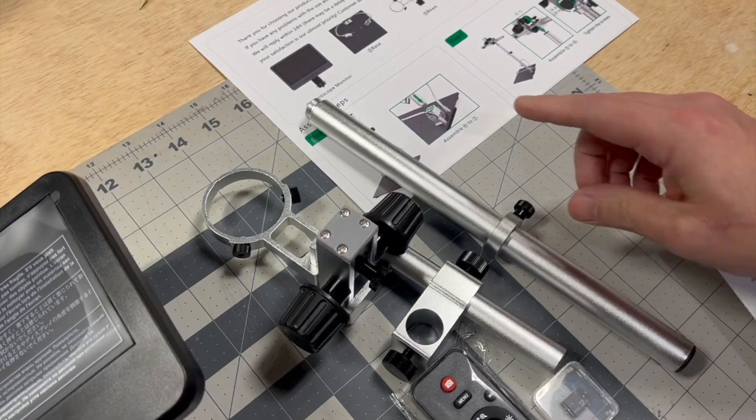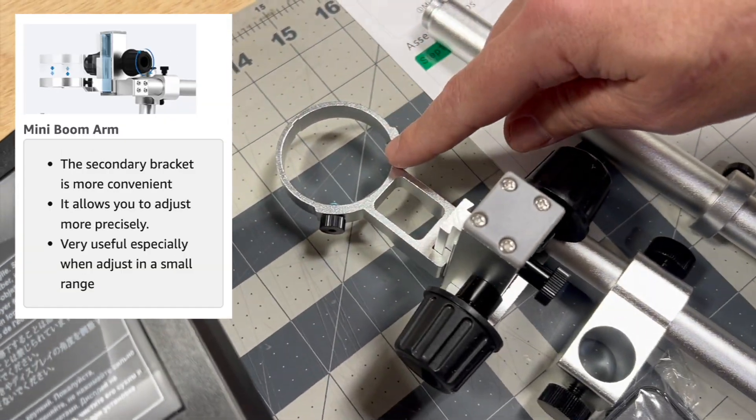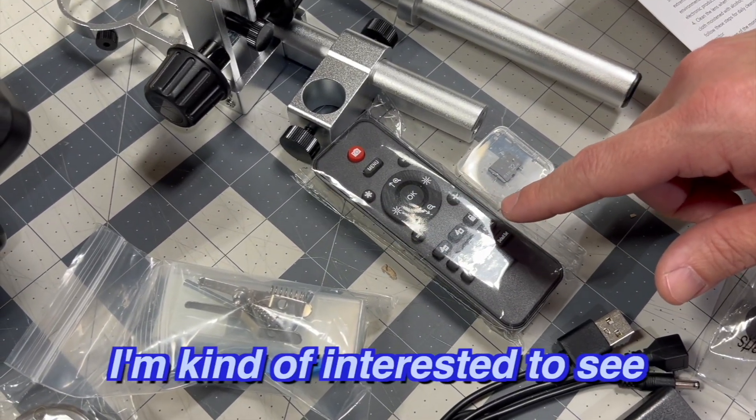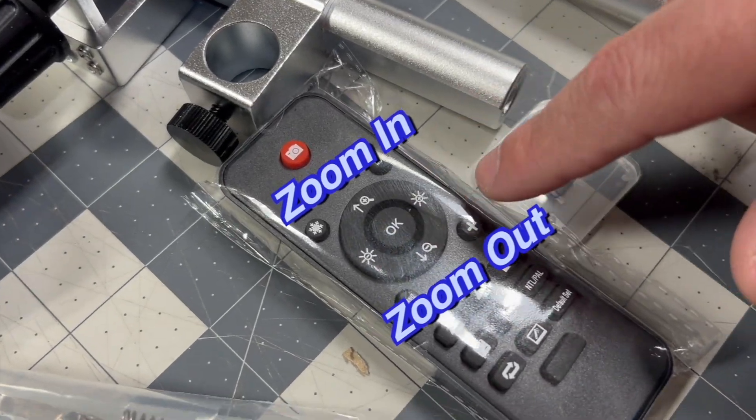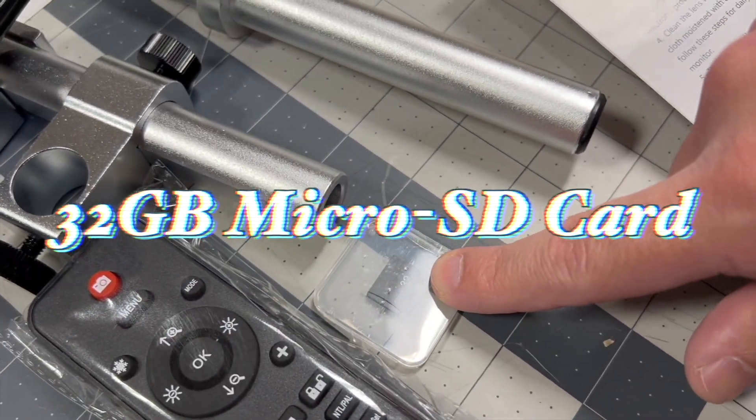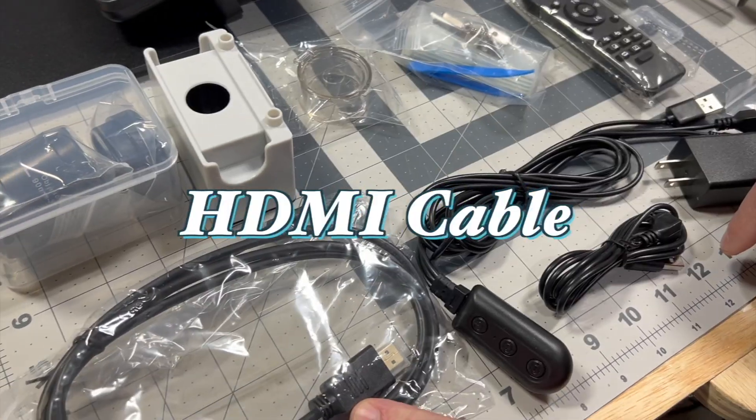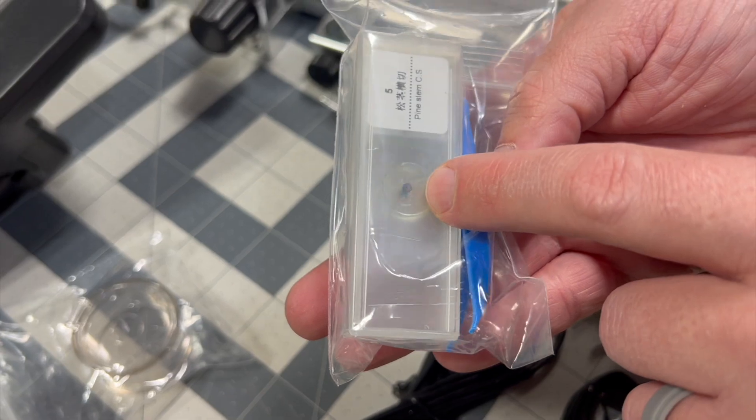And then we've got some bracketry here, our post and the thing that we're going to obviously mount our lens to, a little remote control, which I'm kind of interested to see what that's about. I guess you can start taking video there and zoom in and out, which is pretty neat. And then some light controls. Here's the mini SD card, it comes with some spare thumb screws, power cable and power brick, HDMI cable.